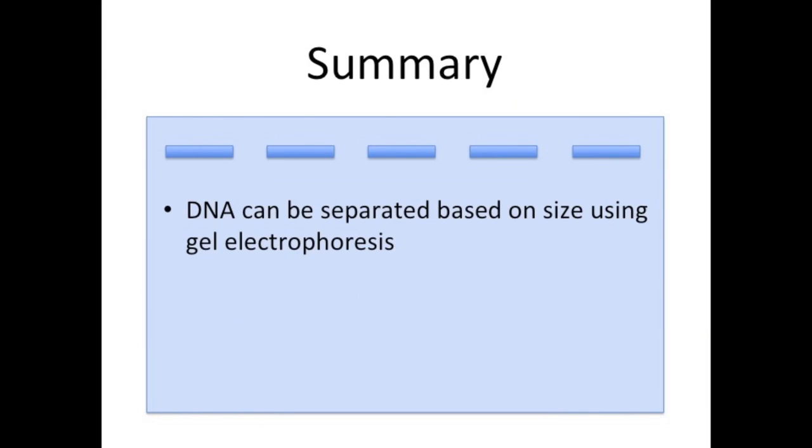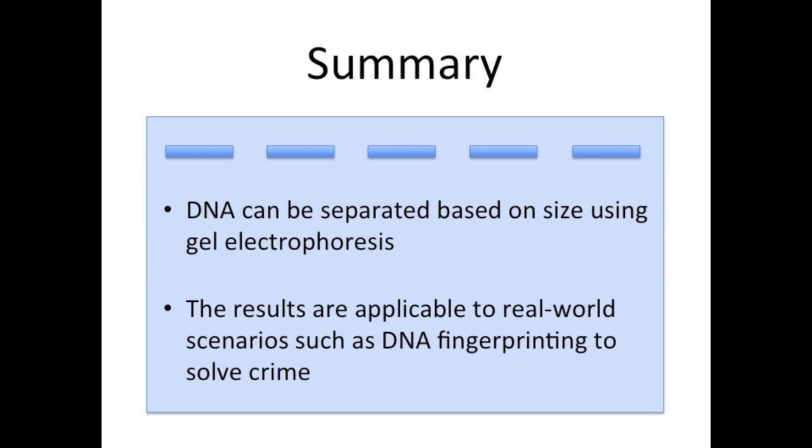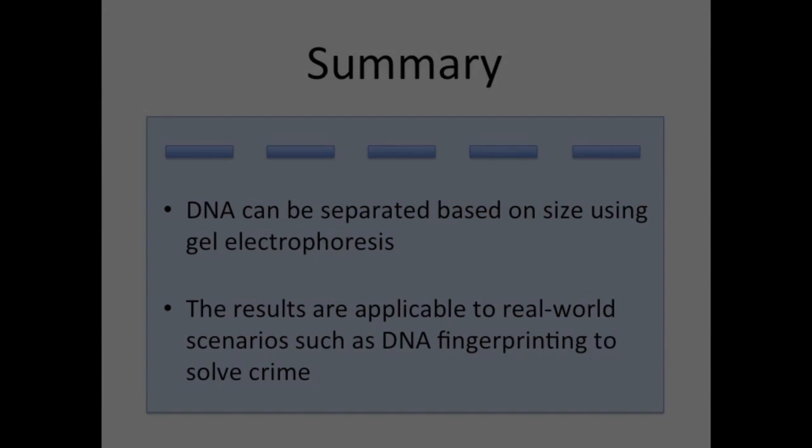In summary, we learned that DNA can be separated based on size using gel electrophoresis. And the results are applicable to real-world scenarios such as DNA fingerprinting to solve crimes.